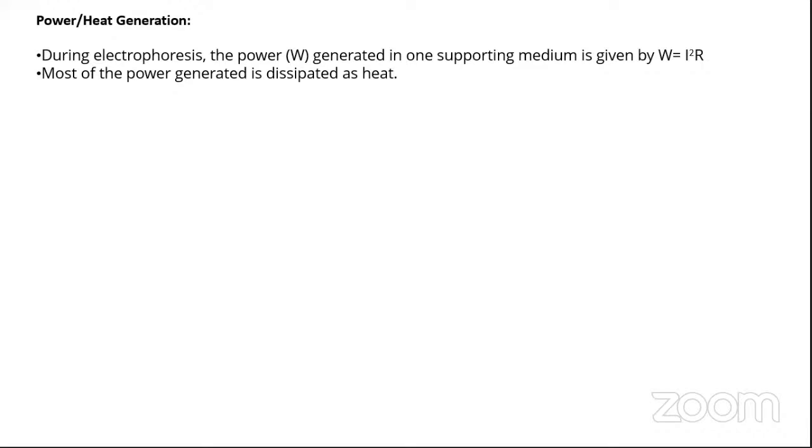Because there is low viscosity, what will happen to resistance? Will resistance increase or decrease? So what we have done till now: voltage increase will increase the current.